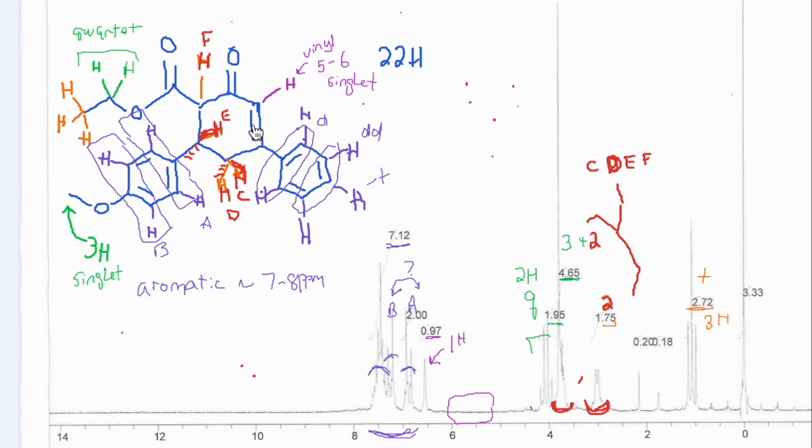it's an allylic proton. It's next to an alkene there as well, and this alkene is conjugated to a benzene, and so there's a lot of electronics going on over here. I'm not sure which of these would be affected more, the one that's next to the other hydrogen or the one that's next to the benzene ring. So in all honesty, I would have to look into this more to try to distinguish C, D, E, and F and figure out which one of these is which. I might do that at some point, but I think that this level of understanding of the NMR is probably more than enough for our first year organic investigations.